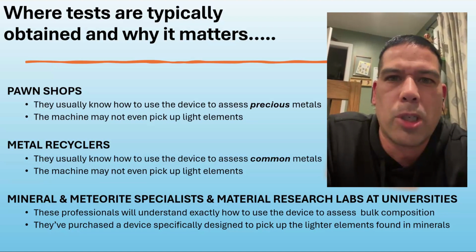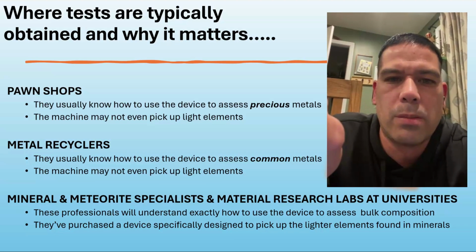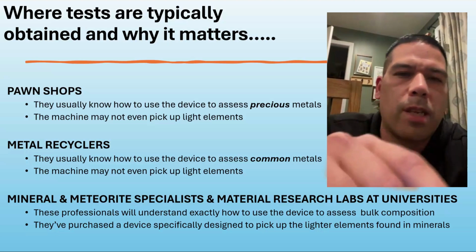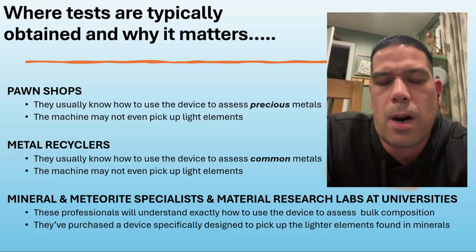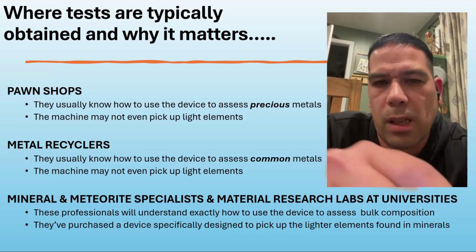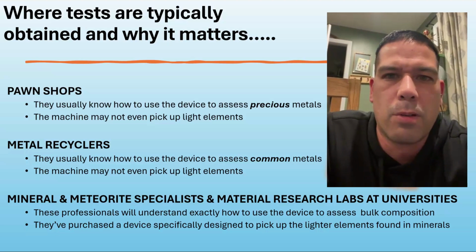Now, what can happen is multiple light elements might give peaks that overlap each other, and in combination, those overlapping secondary readings will be a false positive for what the machine's looking for. So if I stack up the right set of minerals in there, I might get a reading that looks like gold, right? Not that the machine is looking for only gold and only looking for heavy metals like that, but in all reality, what you have is light, non-metal elements producing peaks that overlap each other that combine together give you a false reading.